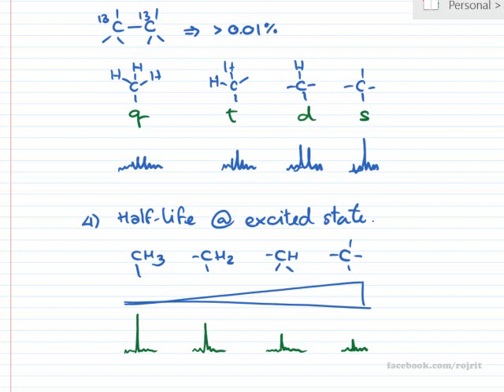And because it's very low, because it's only 1%, with just a single excitation you will have a very weak signal here. So you need to repeatedly excite it, okay, several times, maybe 100 times, to increase the intensity of the signal 100 times as well, right?